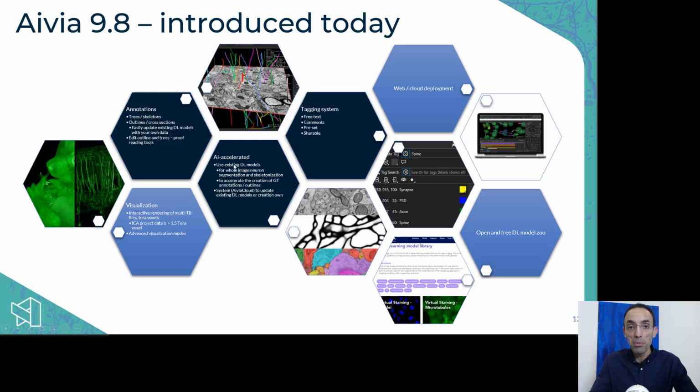We also have a number of AI accelerated tools. We do ship a few deep learning models. I think there will be 3 deep learning models when we release, for the detection of neurons, so the neuron boundary, trained on different types of electron microscopy data: slightly more contrast, less contrast, a little more resolution.